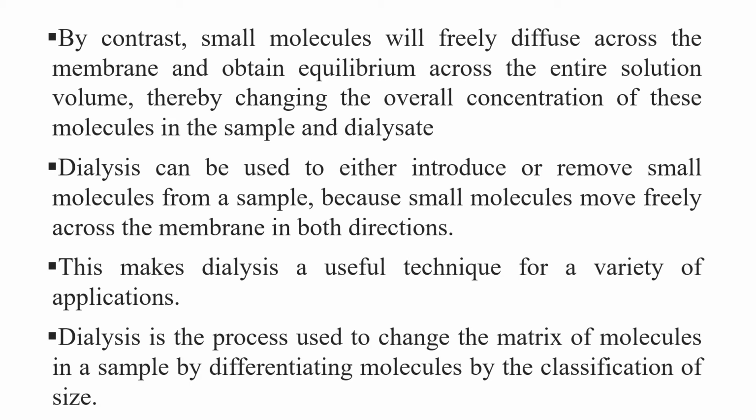So here, small molecules freely diffuse across the membrane and reach equilibrium across the entire solution volume, changing the overall concentration in the sample and dialysate. It can be used to introduce or remove small molecules from a sample because they move freely across the membrane in both directions, making dialysis a useful technique for a variety of applications, and it changes the matrix of molecules in a sample by differentiating molecules by size.